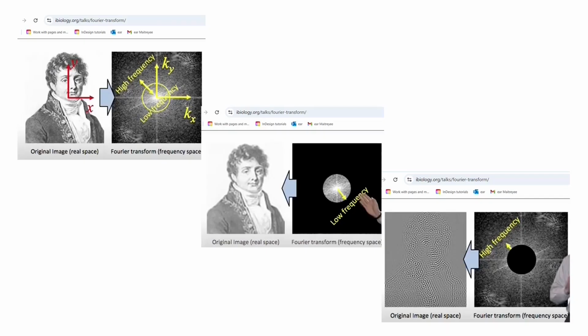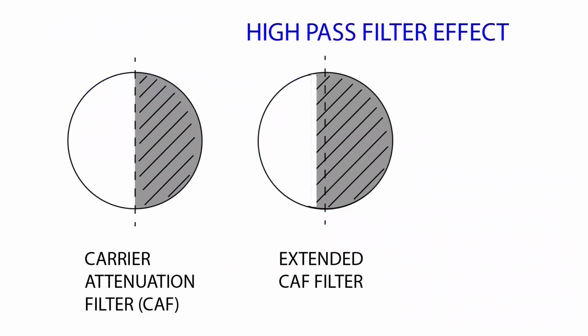In some cases, it may be desirable to use a partially transmitting filter to alter the relative weighting of the spatial frequencies. Brett Schneider and Tunis recommended a similar type of apodizing strip along the straight edge of the CAF half-stop.